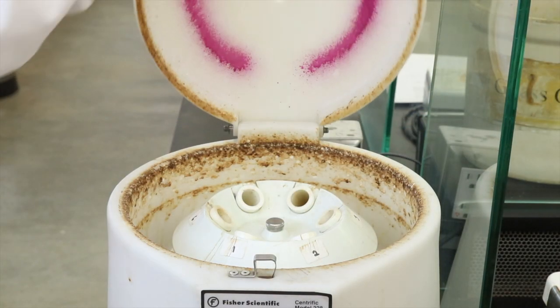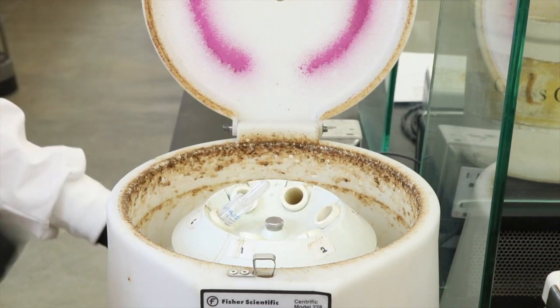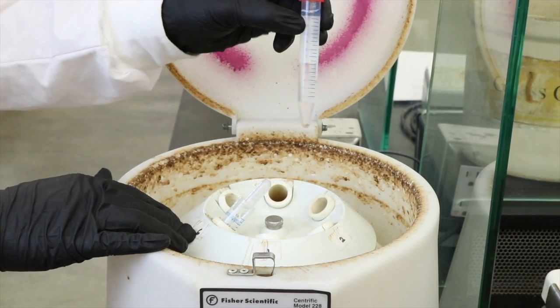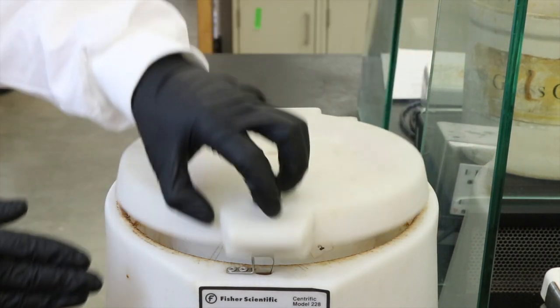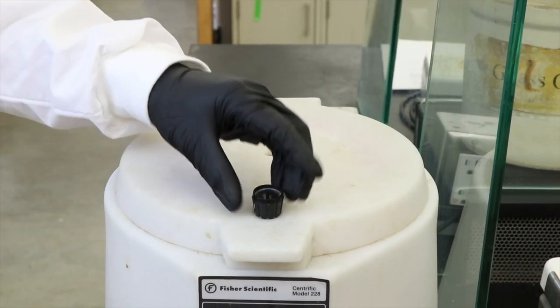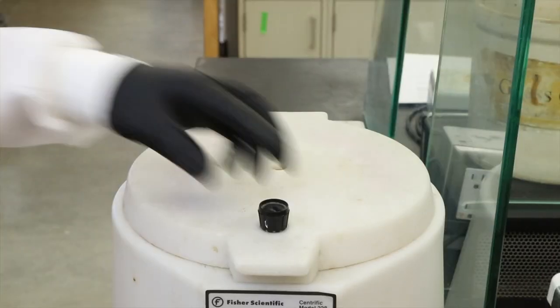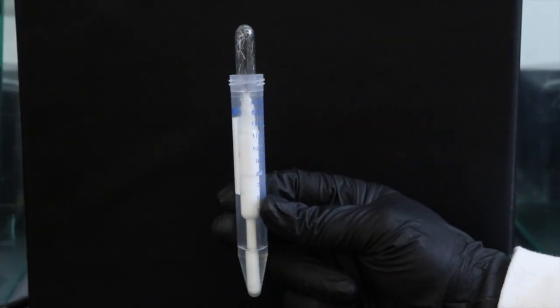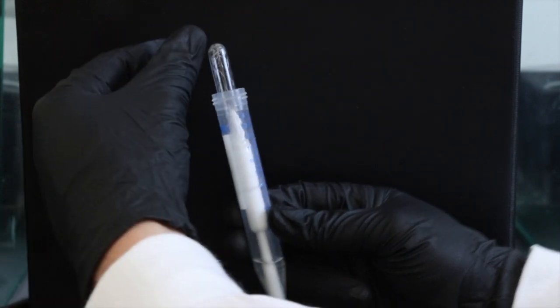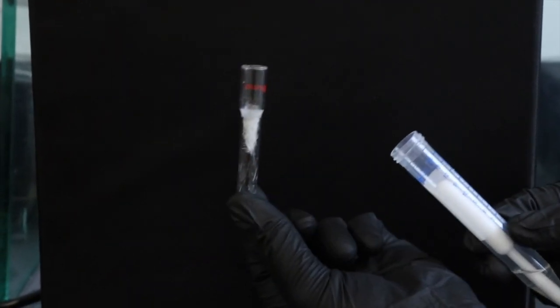So here's the centrifuge. I'll put the test tube with the crystals on one side and then balance it with a test tube that just has water in it on the other side. And then I'll run the centrifuge for a couple minutes just to make sure that all of the solvent is pulled to the bottom of that test tube. Once that's done, I'll remove the test tubes from the centrifuge, and you can see pretty well the separation of the solvent from the crystals. Now I can just remove the Craig tube and we should have a purified alcohol product that we can characterize.